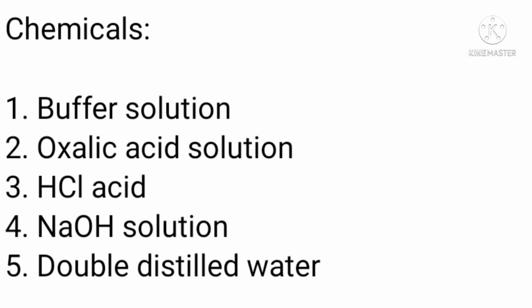And the chemicals that are required for this experiment are buffer solution, oxalic acid solution, hydrochloric acid solution, sodium hydroxide solution, and double distilled water.